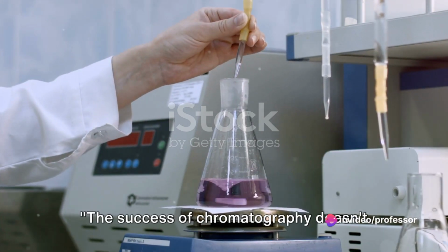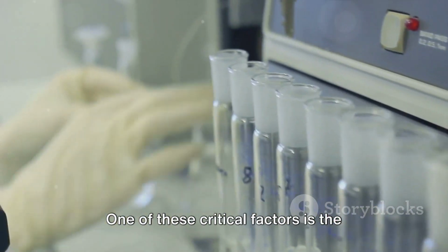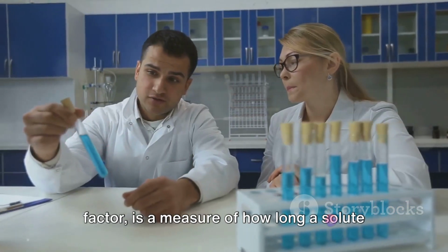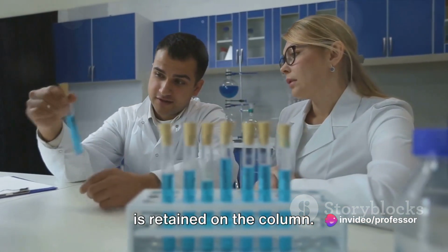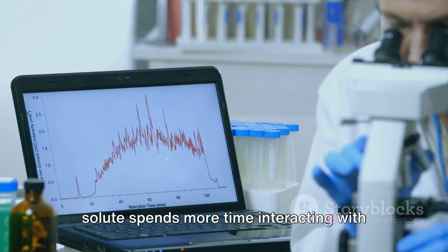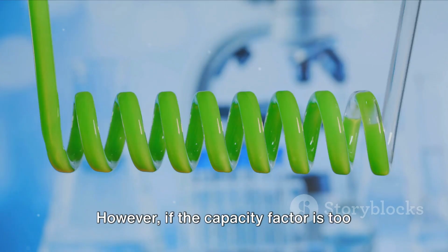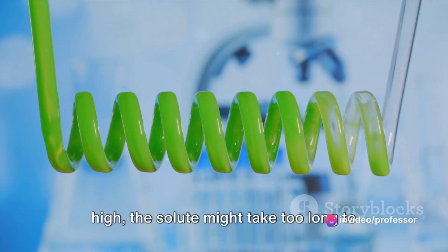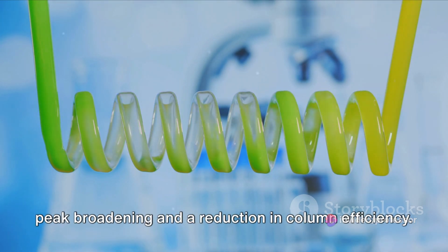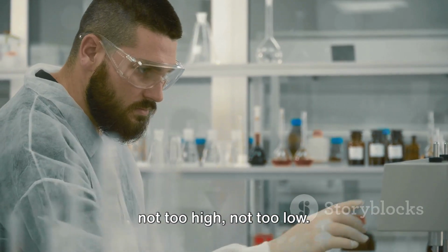The success of chromatography doesn't rest on the column alone. Other factors come into play as well. One of these critical factors is the capacity factor. This factor, also known as the retention factor, is a measure of how long a solute is retained on the column. A higher capacity factor implies that the solute spends more time interacting with the stationary phase, which can enhance the separation efficiency. However, if the capacity factor is too high, the solute might take too long to pass through the column, which can lead to peak broadening and a reduction in column efficiency. So it's about finding that sweet spot, not too high, not too low.